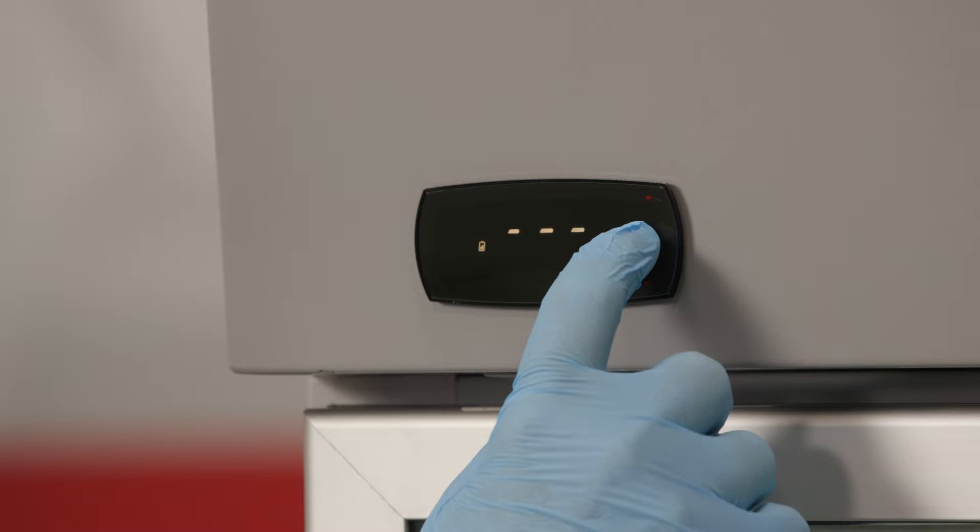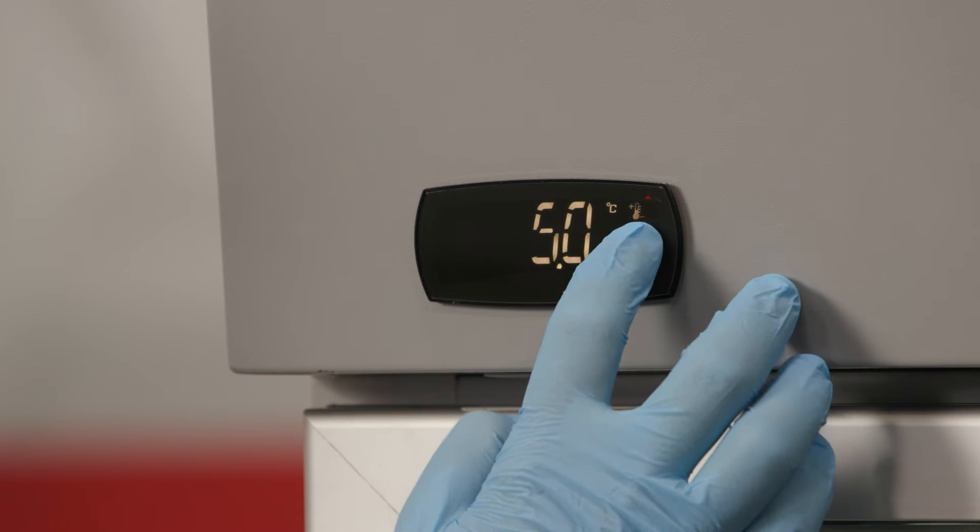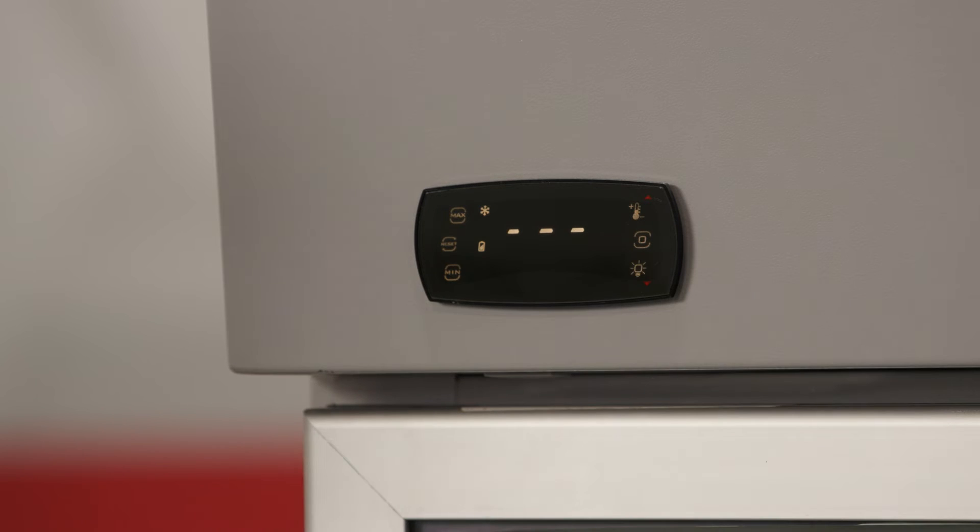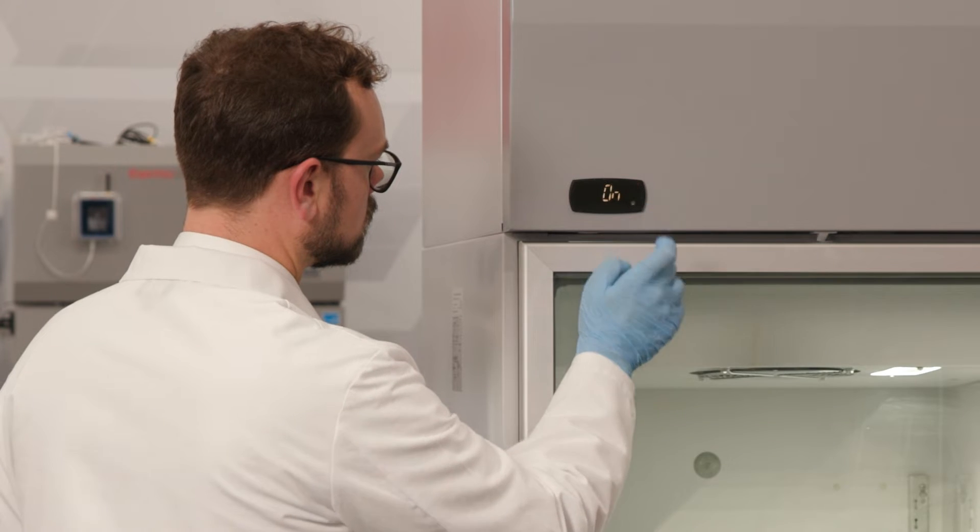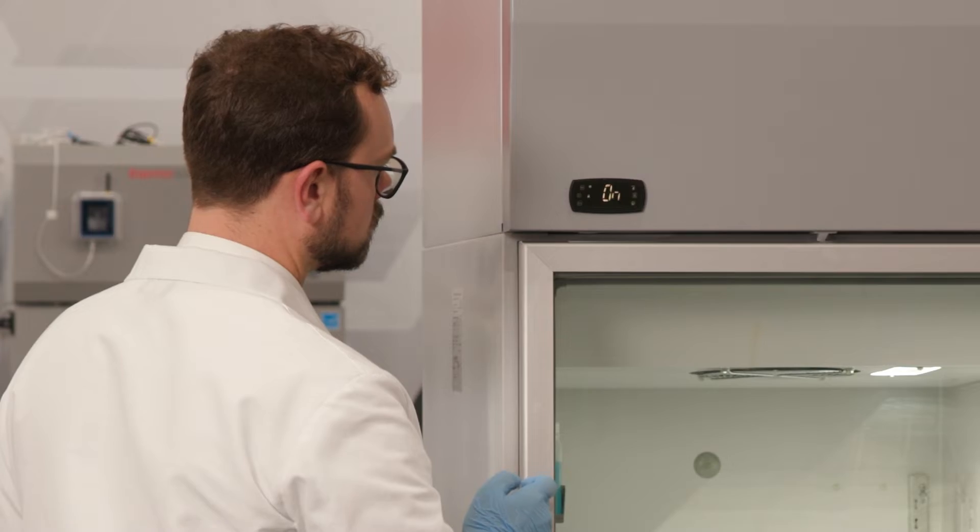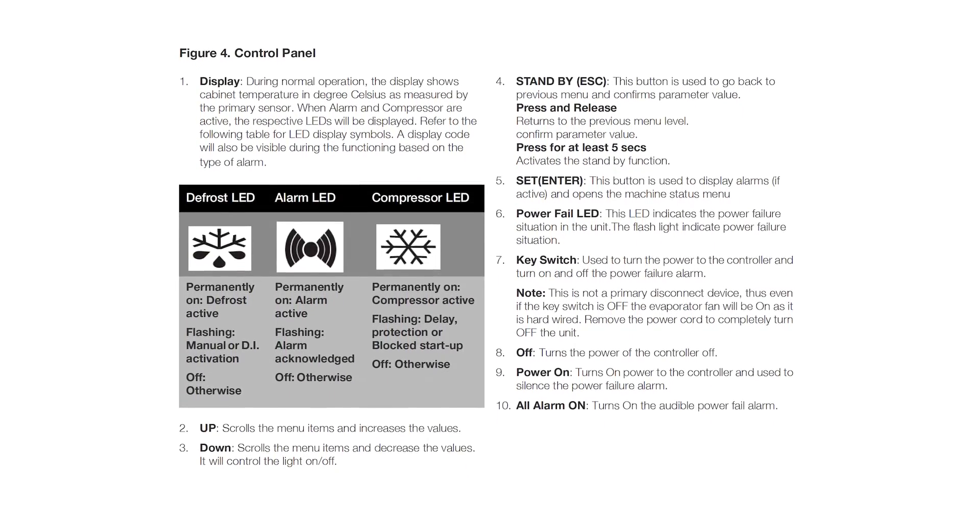Press the setpoint button on the upper right to view the current setpoint. Press the program button to view the various functions. A flashing icon means that its function is disabled. Toggle the function on or off by pressing its icon. Please refer to the user manual for a full overview of icons and their associated functions.